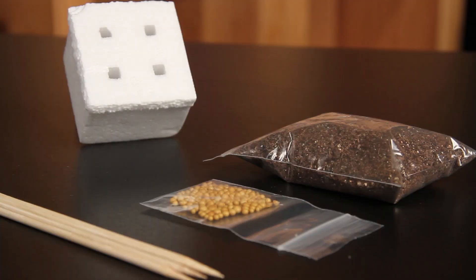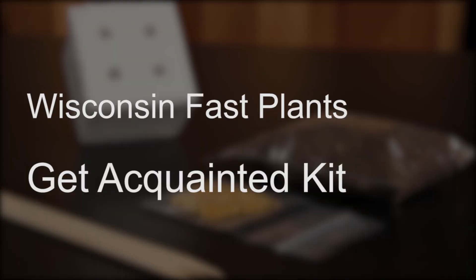For the Wisconsin Fast Plants' fast, fun, and easy planting, you will need the Wisconsin Fast Plants Trial-Sized Get Acquainted Kit.